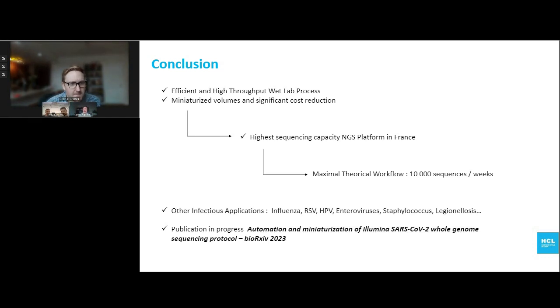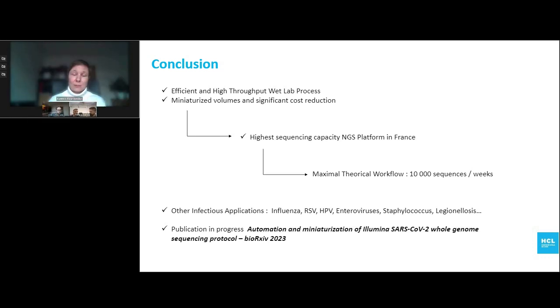That's a very good question, and quite often is asked, especially by the biologists. Contamination can go undetected, so definitely it's something that we need to think about before loading the samples on any automation solution. So there are a couple of things that we focused on when we were designing the instrumentation.